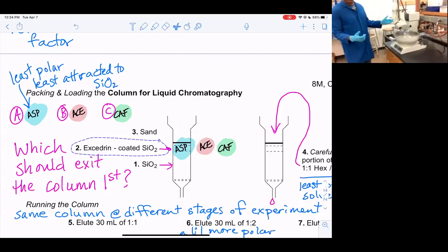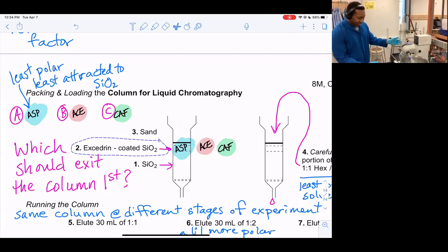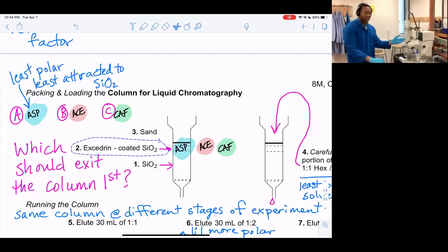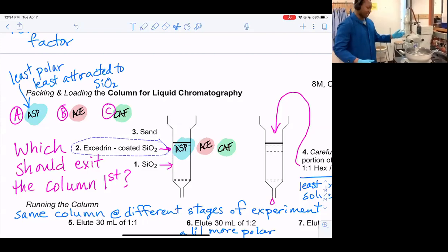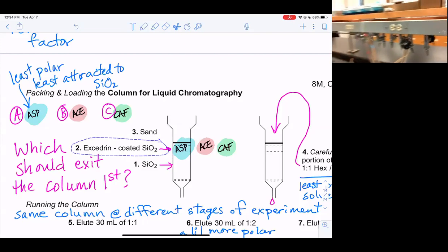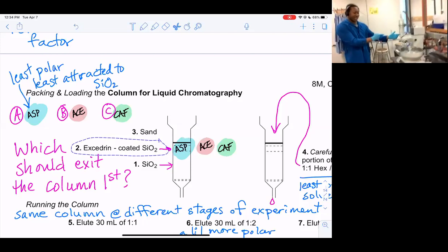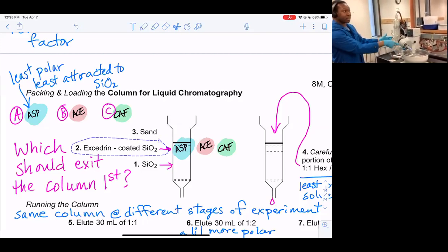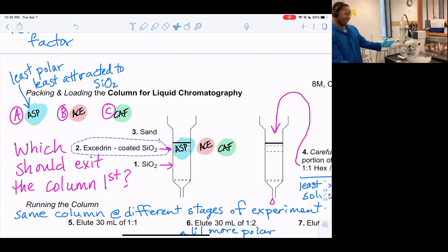So what I do to test it is I can put my finger here first to see how bad it's gonna bump or not bump. So I'm gonna lift it out of the bath to see. Yeah. So yeah, I am breaking a lot of rules right now, guys. So can I borrow a pair of glasses from you, Avery? The ones I'm wearing. Oh, thank you. So yeah, I use my finger as a test. So whenever I see that it's starting to boil off the solvent and not explode in my face, then I can seal it officially and let it do its thing.